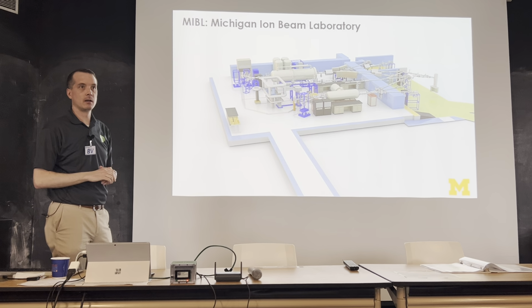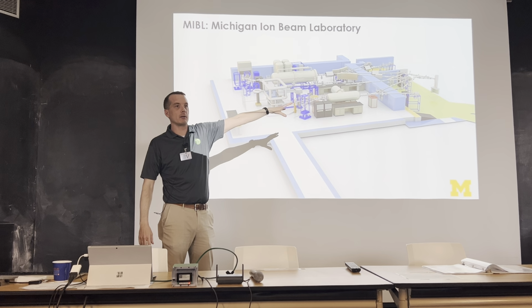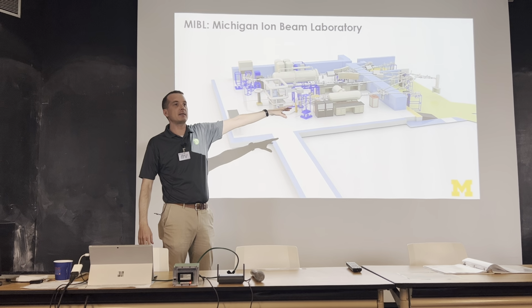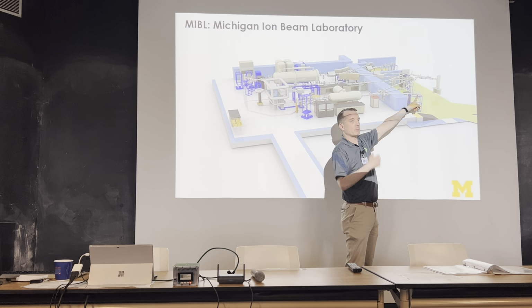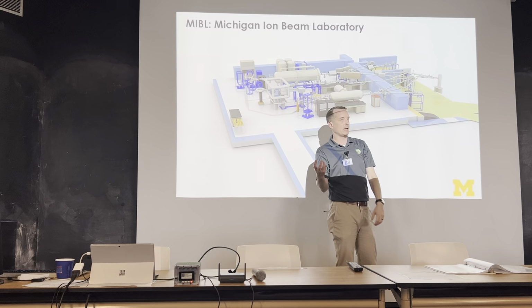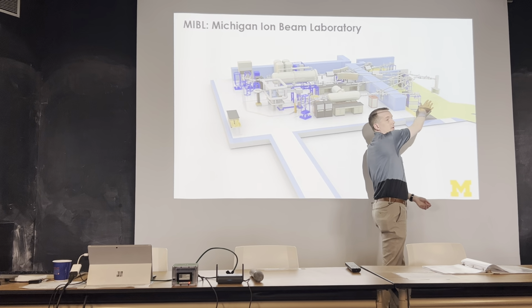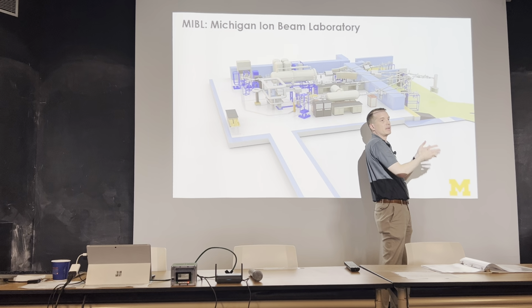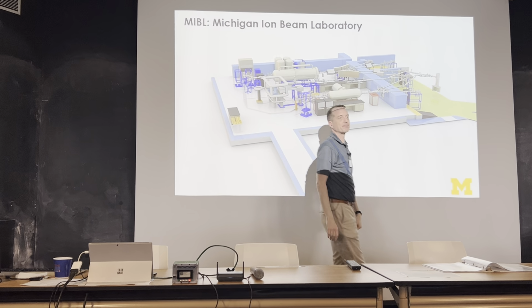What does in situ mean in this case? In situ means that the beams are coming in as you're running your electron microscope. So ex situ would be the older style where you would be at one of these beam stations, you would expose your sample, you would take it out of that station, and then you would put it into your microscope after the fact. The in situ TEM is special, and the in situ part is that you are exposing it and doing the damage as you're watching it happen.